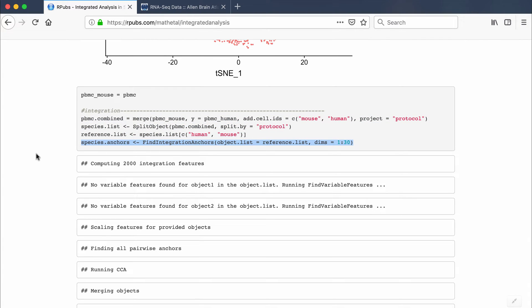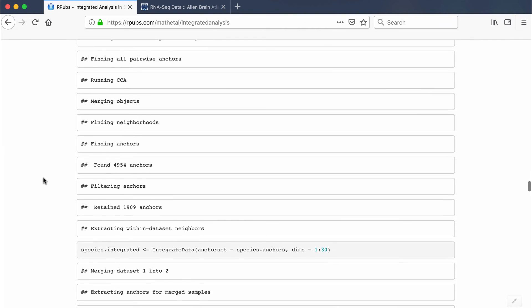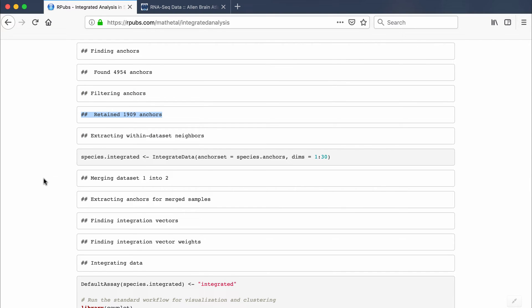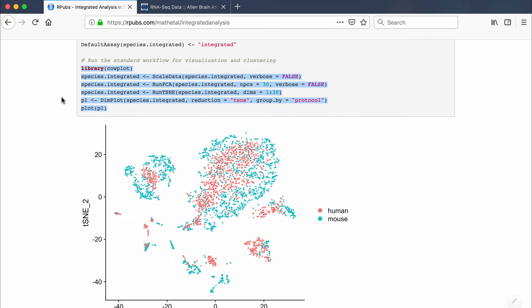The anchoring step is the actual integration step in Seurat 3.0. Previous versions used canonical correlation analysis, but the 3.0 anchoring approach works much better. This step finds anchoring points between the two species using the first 30 dimensions. After running, it finds integrated anchor points, does filtering, and we end up with 1,909 anchors across the two species.